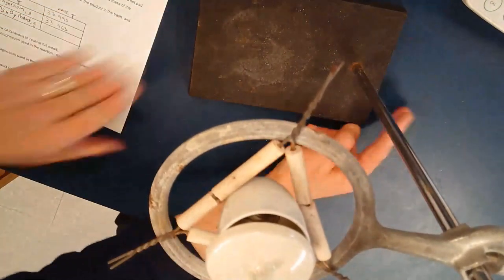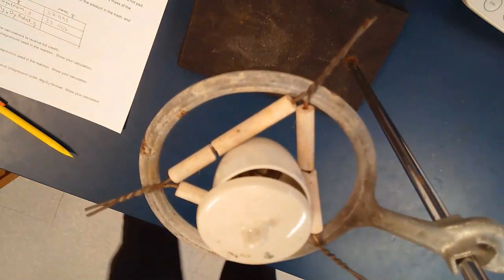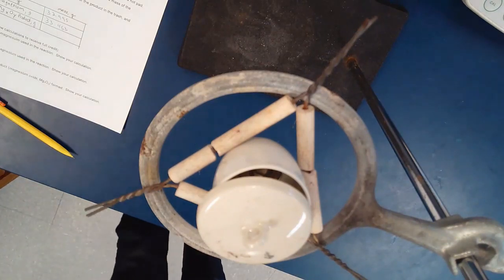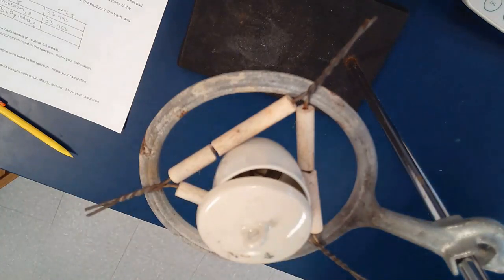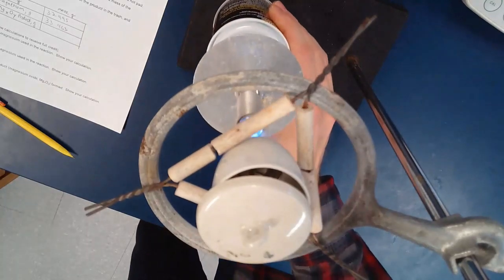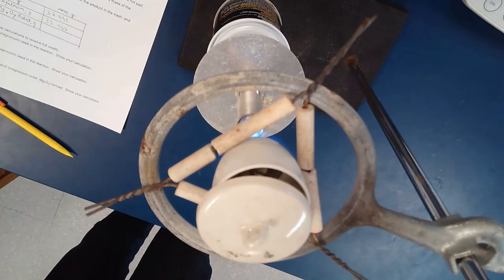There we go. So you can see the crucible is in what's called a clay triangle, in a ring stand. The lid is on, but the lid is off a little bit right now so that oxygen can get in there, because it needs to react with oxygen. So to that, we are going to bring in fire, and it will begin to heat.